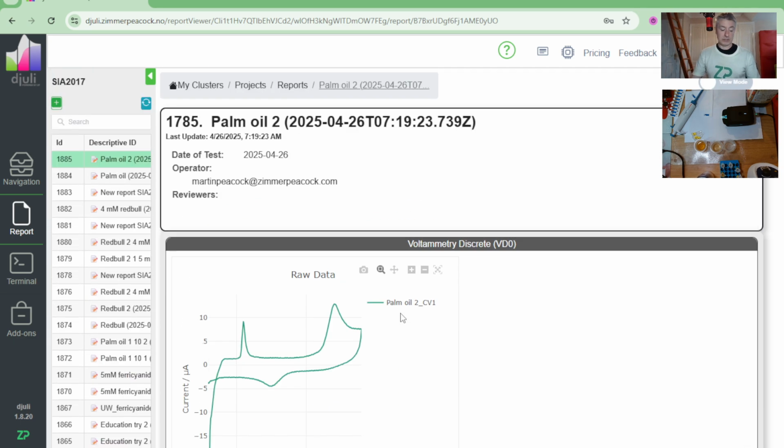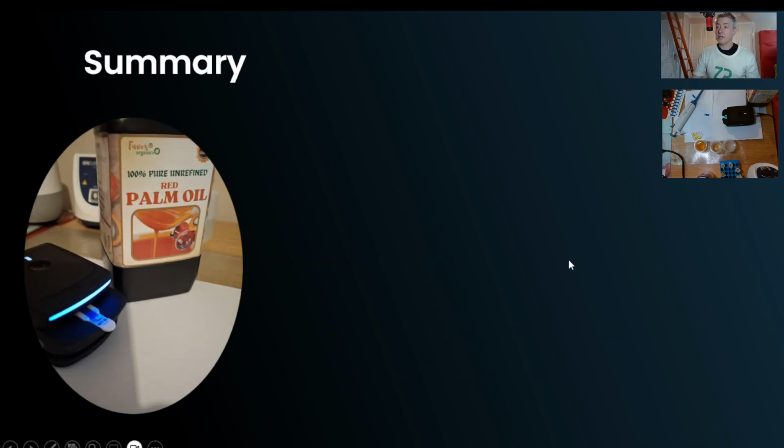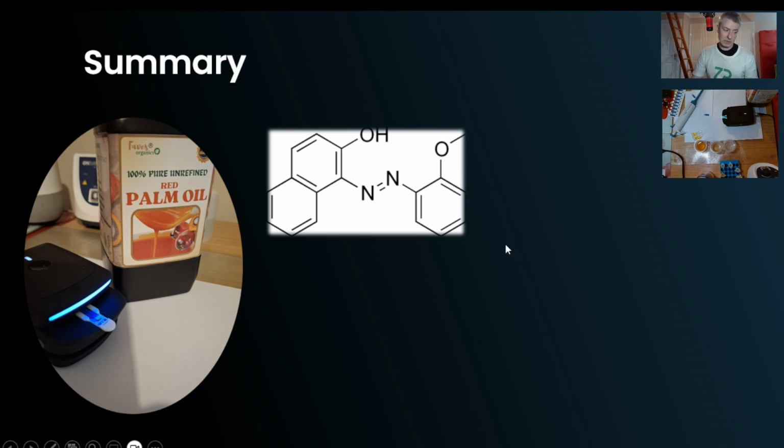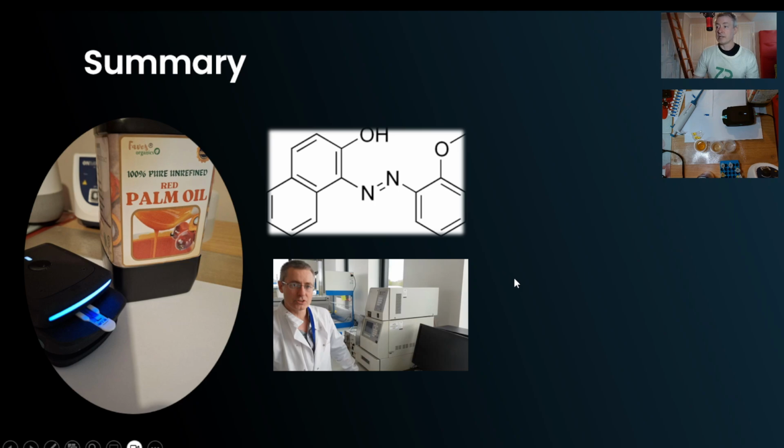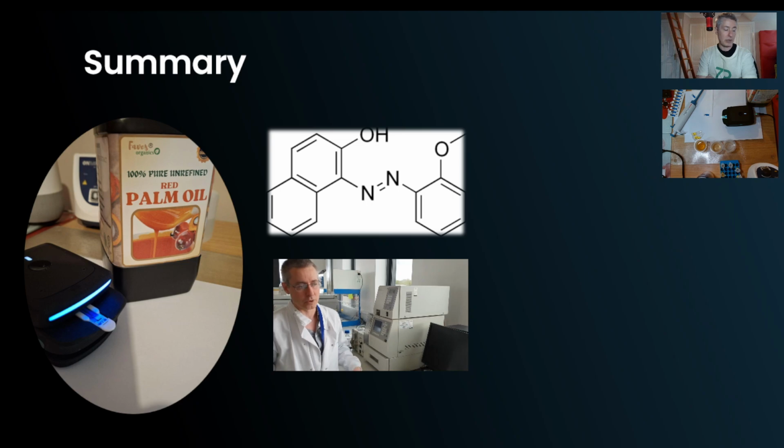So the quick answer to these people is, can the ZP technology be used with palm oil? The quick answer is you can, and you get really quite nice voltammetry, which you can turn to your advantage. So in summary, palm oil is a staple food commodity. It has been adulterated with things like Sudan Reds. The incumbent technology for detecting and quantifying this is HPLC. It's applicable, but I wouldn't say it's even practical.